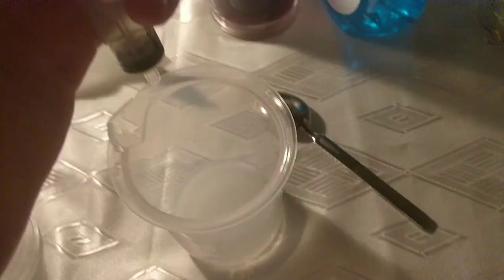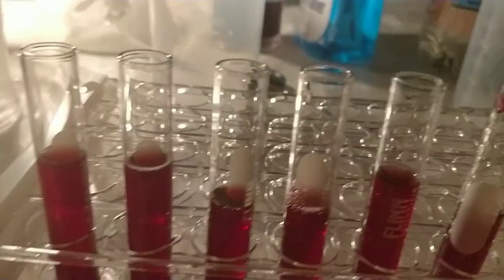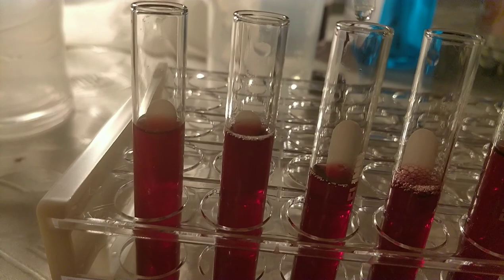Next I'll do the baking soda — one milliliter into this test tube. This one definitely changed. As you can see with the other ones they're all much lighter, but the baking soda made it a much darker purple. I'll write that down.